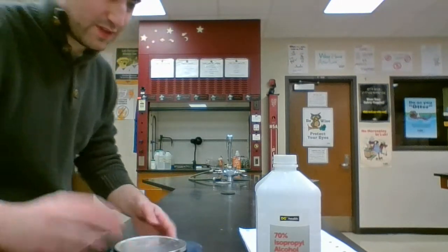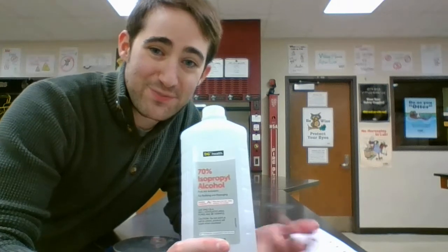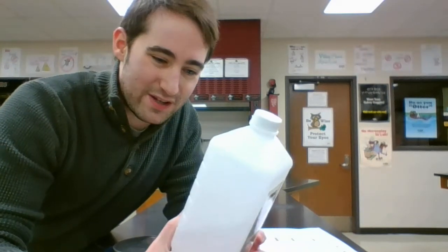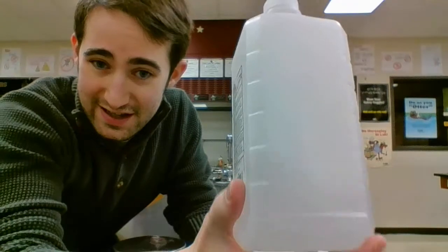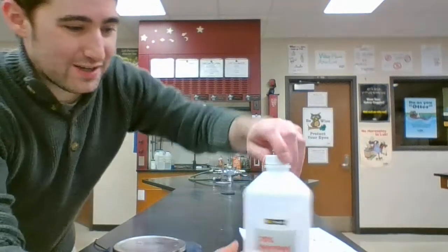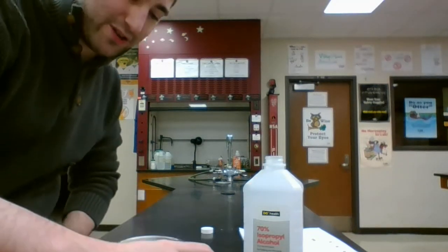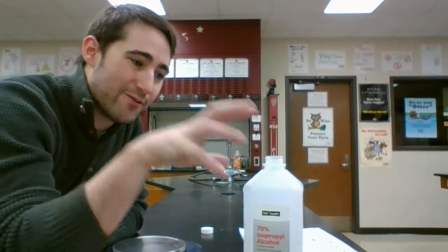What the 70% means is that 70% of this is isopropyl alcohol. That's a chemical. It's a pure substance. And the other 30% is water. Now, looking at it in here, it's not like I can pick apart the different parts of this mixture. I can pour some out into a beaker and show you. And I also want to figure out the density of this mixture.